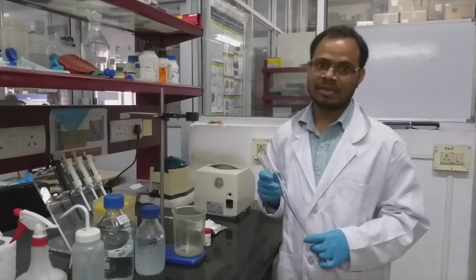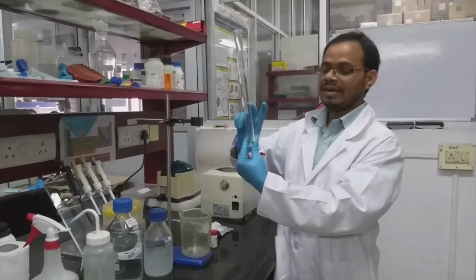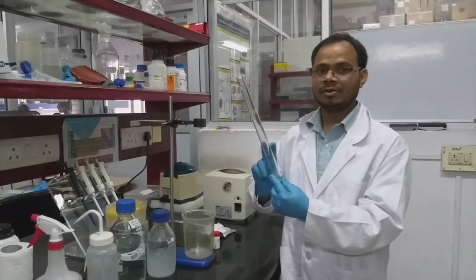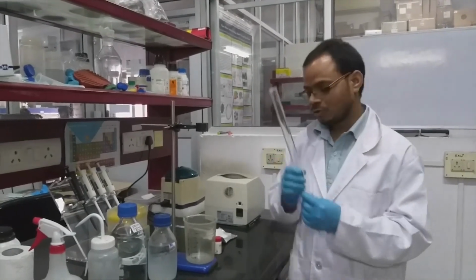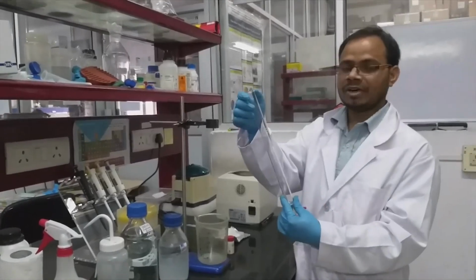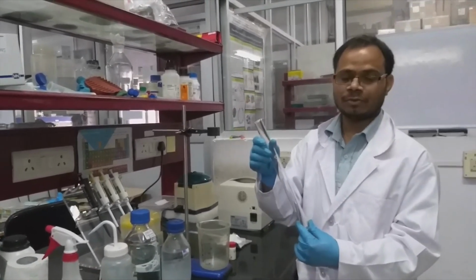That will improve the resolution of the molecules. Otherwise, if you use a short column like this, then the resolution is improper, and you may get another protein in the same fraction. So here we are using this. It is sufficient to elute one small size and another large size molecule.